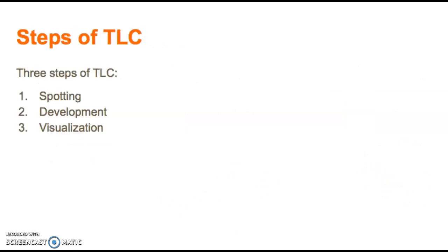There are 3 steps of TLC. Spotting, which is applying spots of analyte to the line that's placed 1 centimeter from the bottom of the plate. Next, we have the development step, which uses a developing chamber or vessel and allows solvent to move up the plate, but does not let it reach the end. And lastly, the visualization step, which removes the plate and almost immediately draws a pencil line across the solvent front and also uses a shortwave UV light.